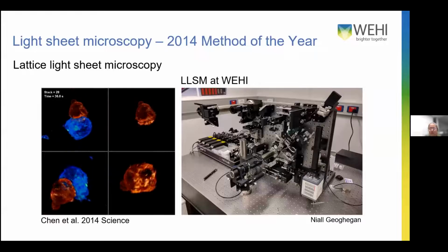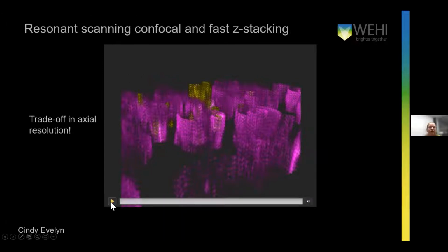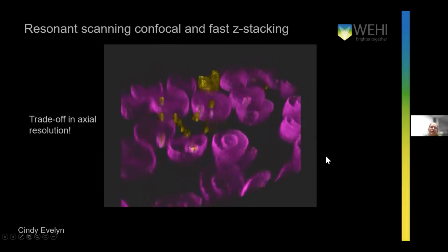So we expected that if we had a more extended Z stack, and by the way, that was heavily undersampled because we didn't want to be too toxic. So we used the resonance scanner, which does tend to be much less phototoxic than a conventional scanner. And we just undersampled in order to make sure that we could capture the events. So I'll just show that to you one more time. You can see laterally, we get quite good resolution. The data is very noisy.